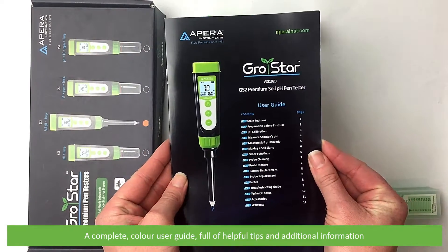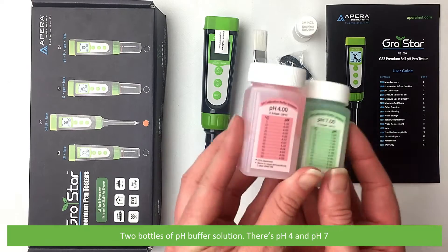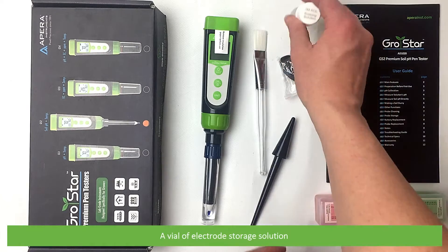Two bottles of pH buffer solution — there's pH 4 and pH 7 — and a vial of electrode storage solution.